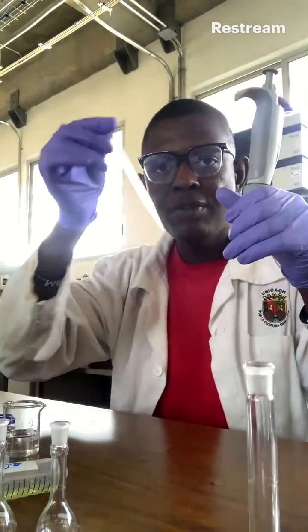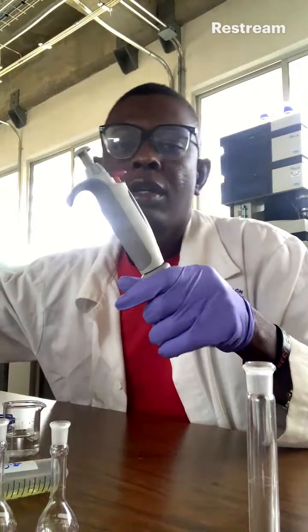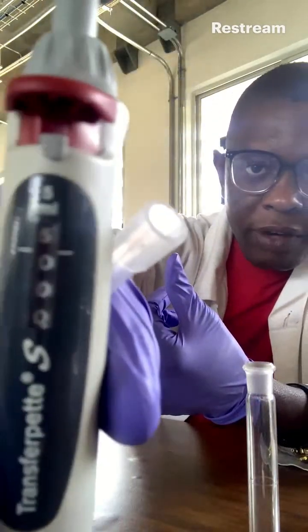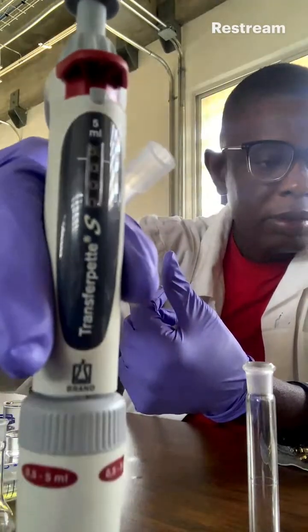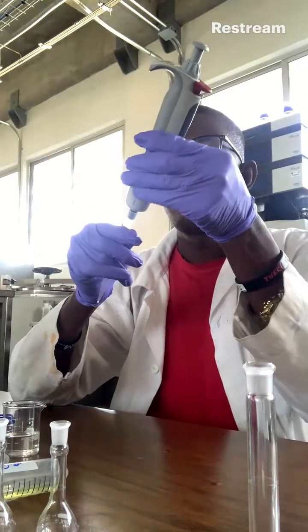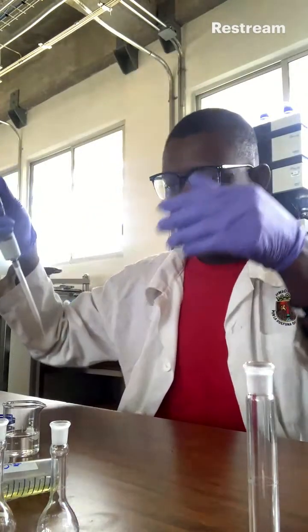I will change the valve for picking. So I set this at 5 ml because I am going with 5 ml. I close again.